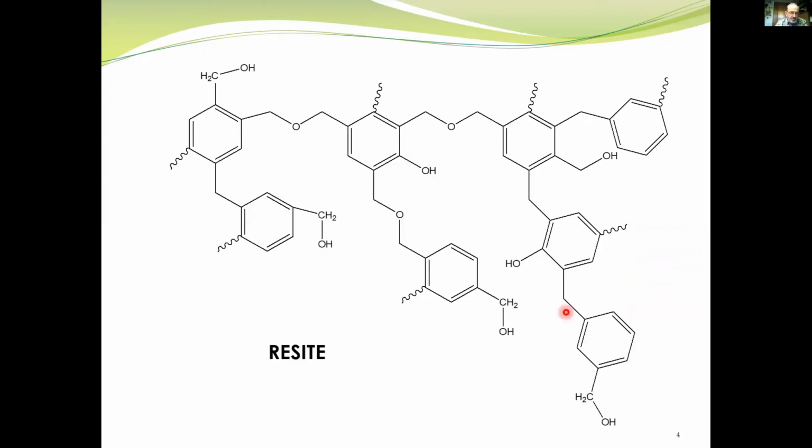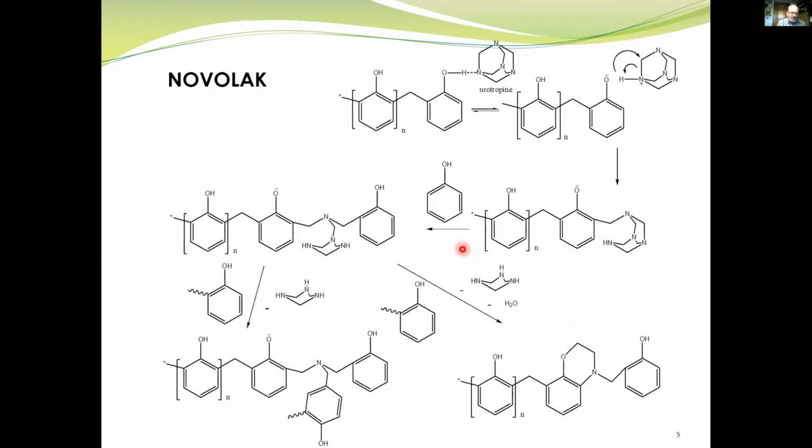Two types of resins are applied in the manufacturing. Abrasive material is most often a mixture. One resin is a thermosetting material, and it's cross-linked with the use of elevated temperature. The second resin is Novolac.